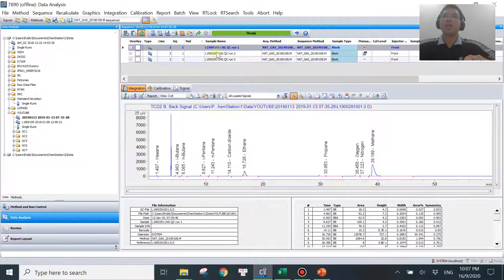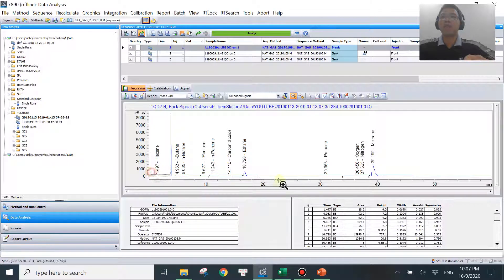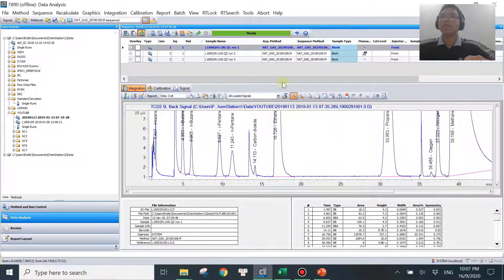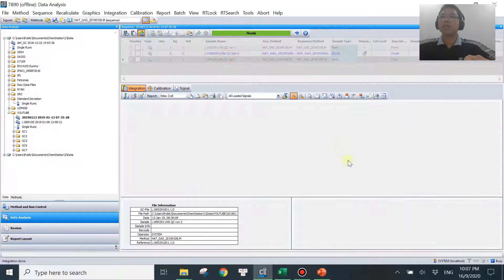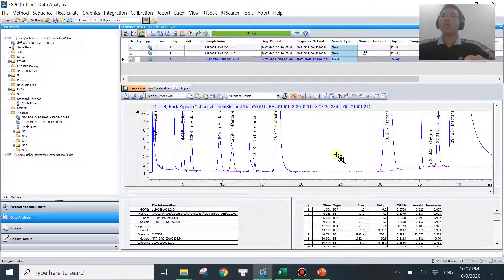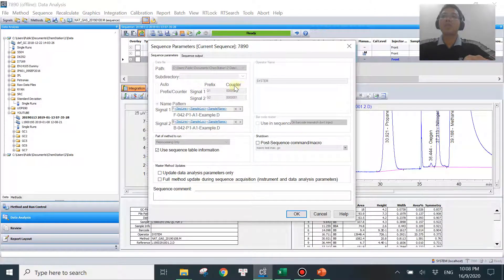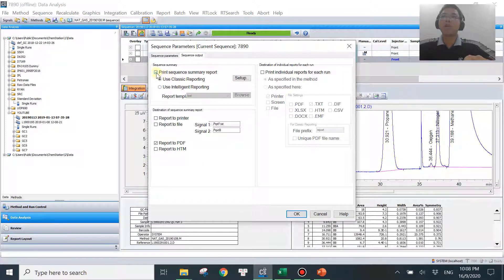To generate that report, the first step is to go through every single program, verify the iteration settings, and save the method if you adjust anything before generating the standard deviation report. I'm happy with all the iterations across all three runs. Once you're happy with all your data, go to Sequence, then Sequence Parameters. You'll see your typical sequence view, and then go to Sequence output. Down here you have 'Print Sequence Summary Report' — check this box to select it.